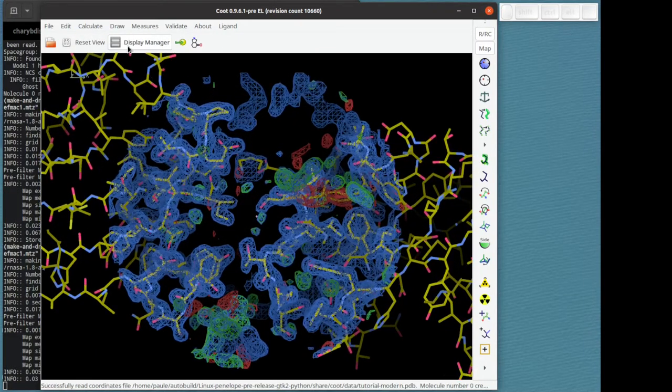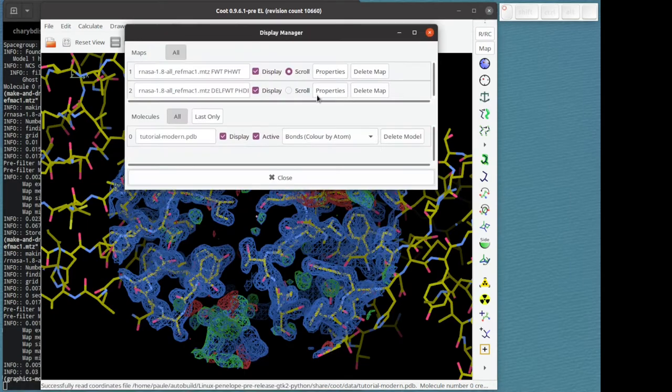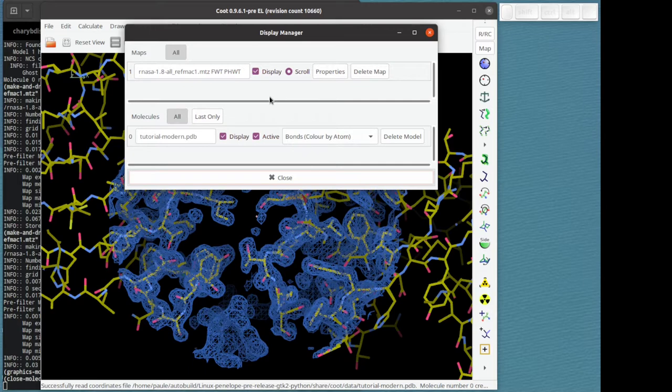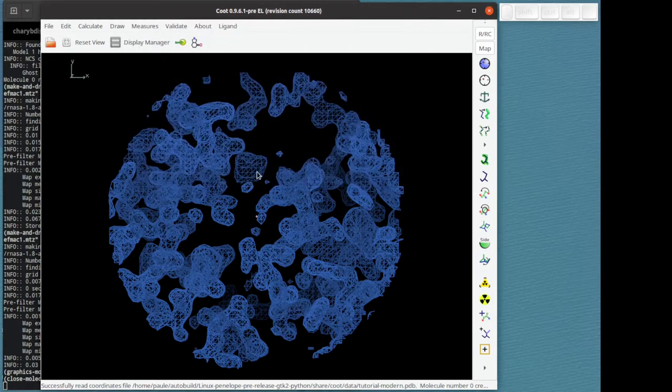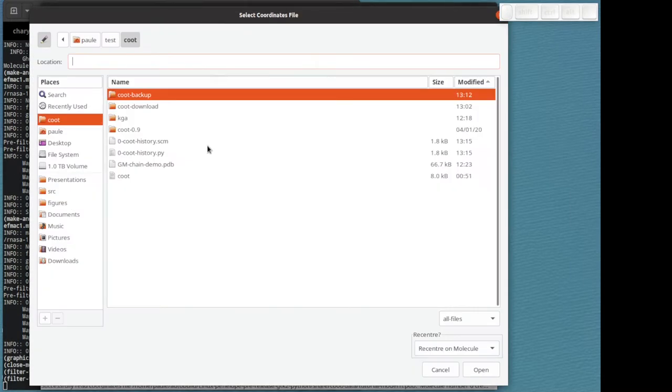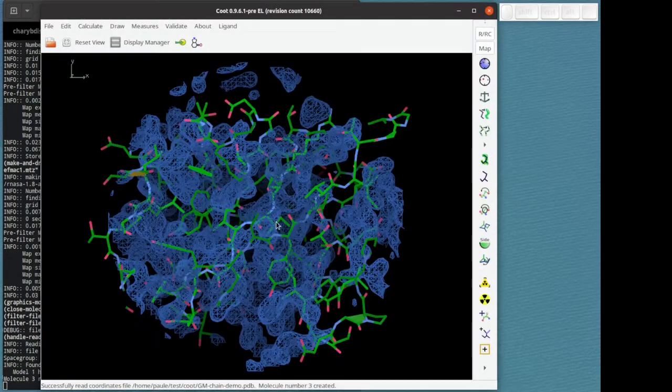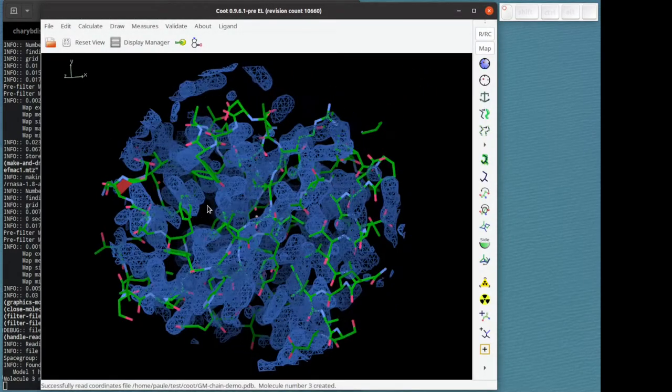Let's use the display manager to undisplay or actually delete the difference map and undisplay the model that comes with the tutorial data. We're going to load in our file that we just downloaded.